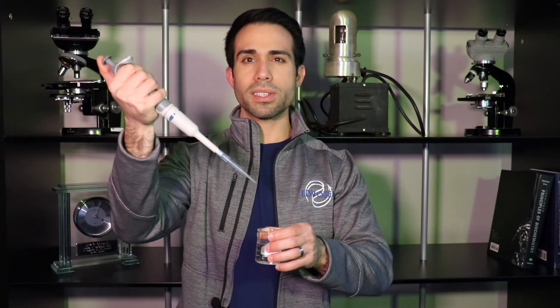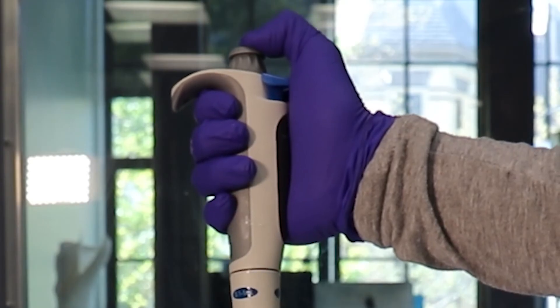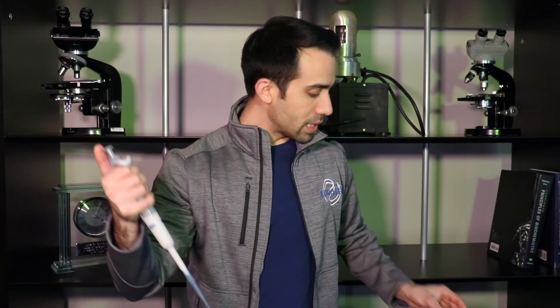Now, dispensing is different. Same method — push down, and when you hit that first stop, push beyond it. This is because sometimes a small volume of liquid can get stuck in the tip. This is important because even a small volume can have a major impact on your research or whatever you might be working on.